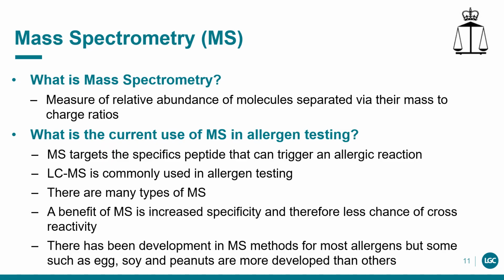While MS-based allergen testing has been in development during the last 2 decades, with methods now for use with eggs, peanuts, fish, and soybean, additional research is still required, for example, with optimizing an approach for the detection of mollusk-derived allergens.